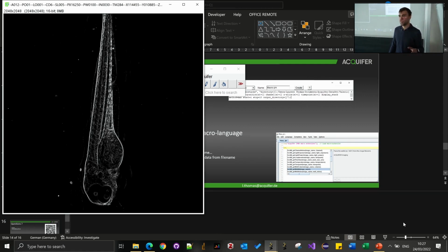Because let's say now I didn't put time point 1, but all the time lapse, the 15 time points, and you're going to wait 2 seconds for each frame multiplied by I don't know how many image planes. So yeah, escape is going to stop it.